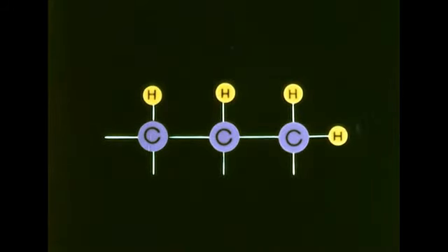Spin-spin coupling is transmitted through bonds, not through space, and does not normally reach beyond protons on adjacent carbon atoms, that is, 3 bonds. Coupling through 4 or more bonds is usually very small.